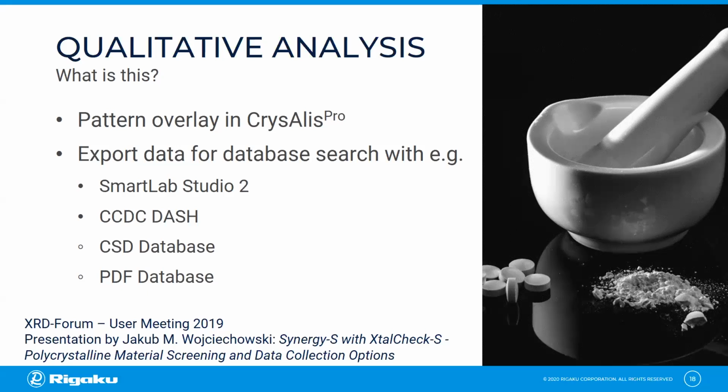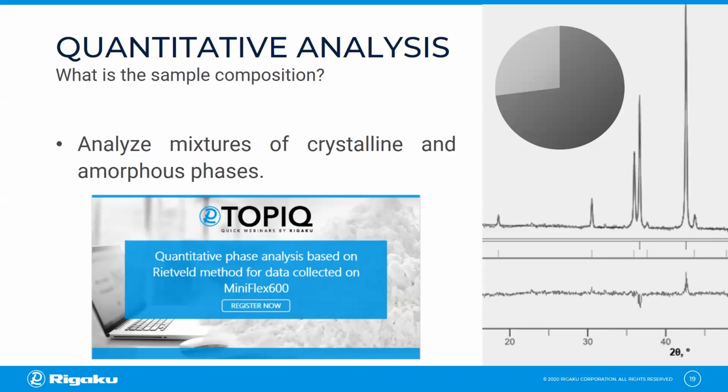The best renowned databases are the CSD and the PDF databases. If you are interested in qualitative analysis, Jakub Wojciechowski held a talk on this topic during our last user meeting. Among many other talks, this has been published in our X-ray forum. Once you determine the components of your mixture, you can also quantify them by various methods. Here I would like to reference the other webinars of this series that are concerned with this specific applications.